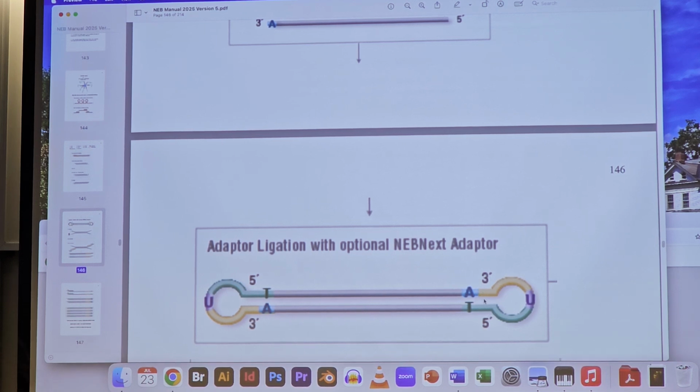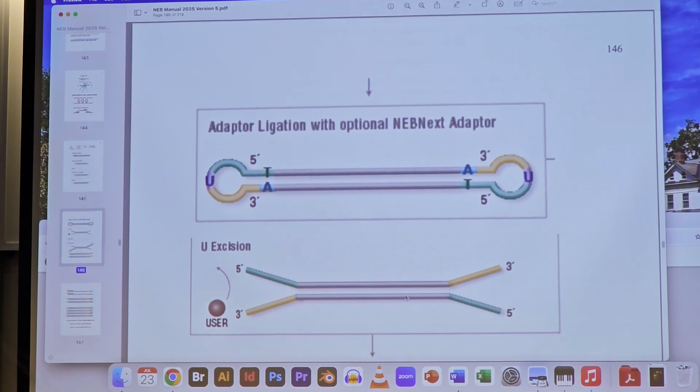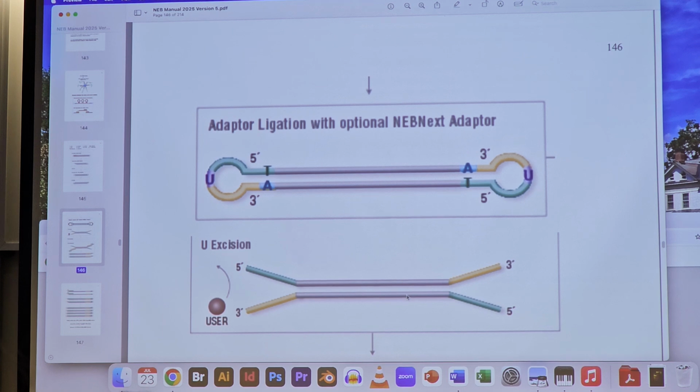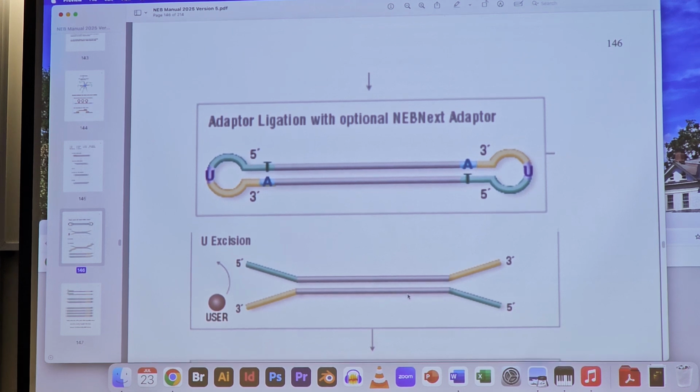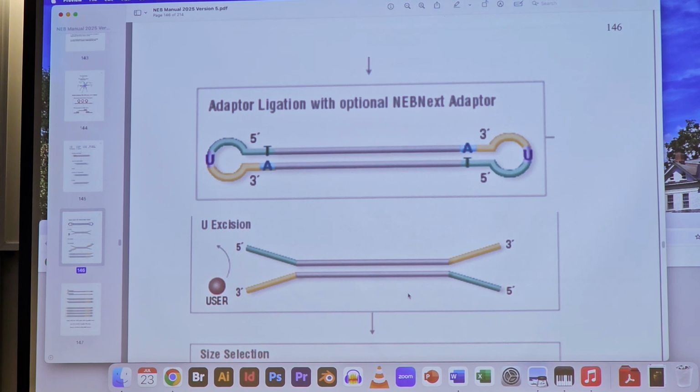Oh, those would be fine. Still be hybridized. Same thing at this end. And so in the figure, it's not clear, but the beginning of the green and yellow here would still be hybridized on both sides. Okay? Those of you at NEB, you can hire me as a consultant to make your figures a little more accurate. It's not bad, but it's not perfect.